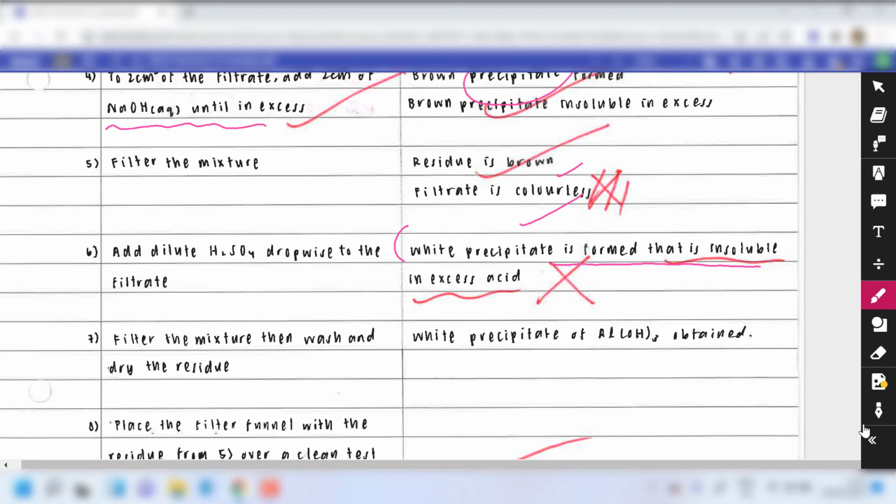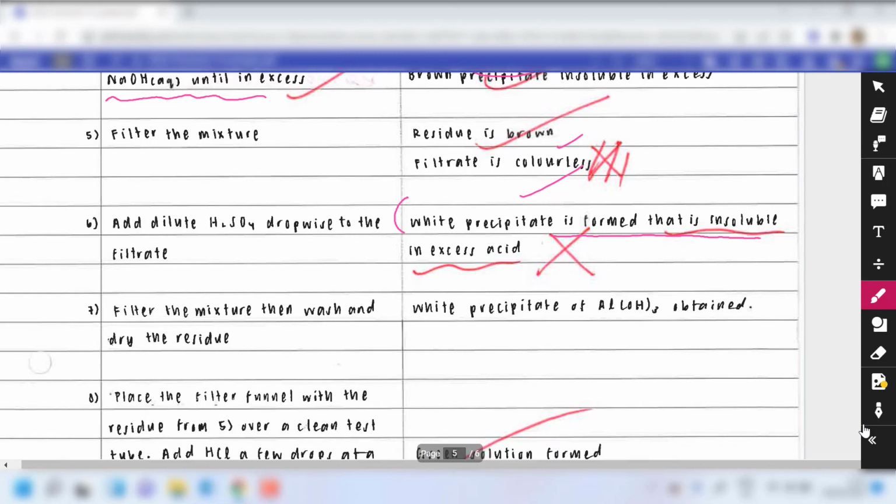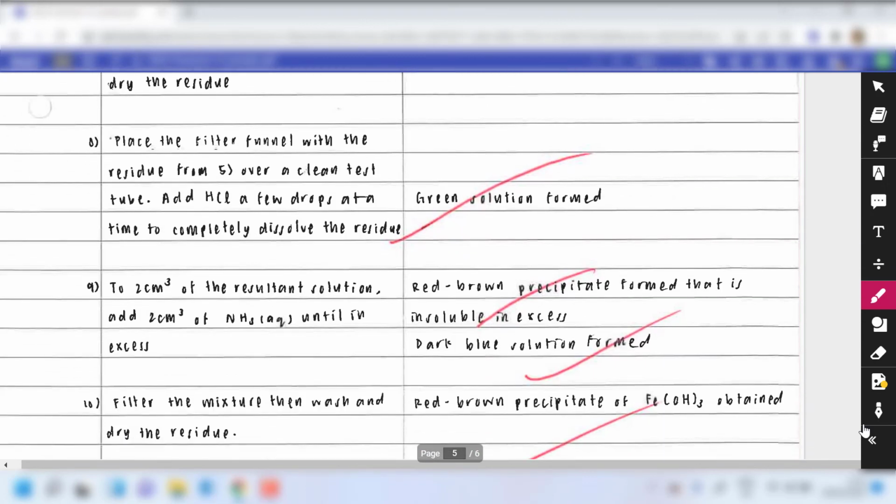So as I mentioned earlier on, probably the best way in this case is, in the filtrate, you add excess acid and turn everything into Al3+, and then you add aqueous ammonia to the Al3+ to get copious amounts of aluminum 3 hydroxide as the white PPT, and then you perform a filtration. So that might be a much better way of obtaining the precipitate. This is food for thought. I hope you understand where I'm coming from. And then I think the rest are minor details, because what we have here is really what we have already experienced.